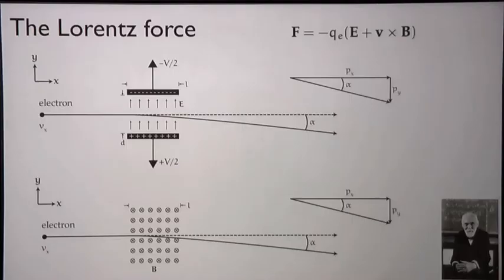So we have a beam of electrons. How are we gonna make a lens? So before I tell you how we make a lens, I have to tell you how we move an electron. So for the students in the room, this would be the only equation I would really pay attention to. Right? There'll be plenty more equations, but this is the one you want to remember. So this is the force on an electron, or any charged particle. Actually, it's called the Lorentz force, and it's a product of both the electric field and the magnetic field times the velocity of the electron.